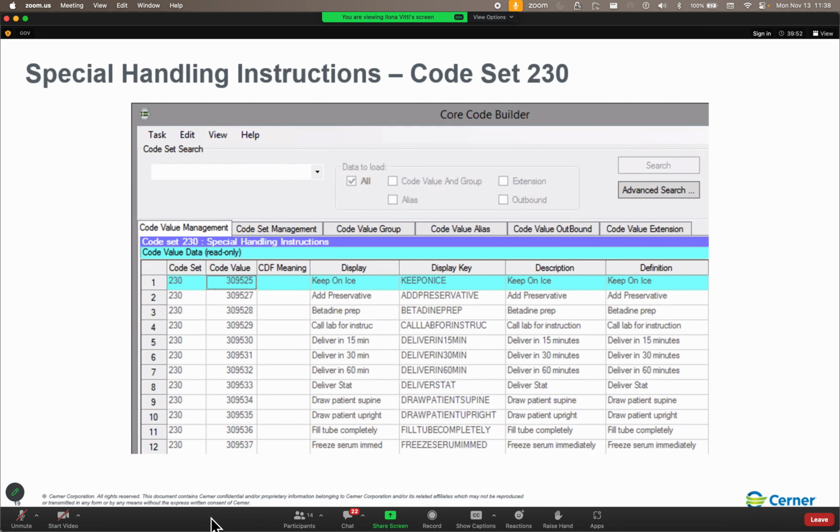I will also say that there is actually a really good self-paced learning called the Cerner Millennium Discern Explorer 1 WBT that I recommend everyone take. So Cerner Discern Explorer 1 or Cerner Millennium Discern Explorer 1, they're both web-based. It's going to be a web-based training.